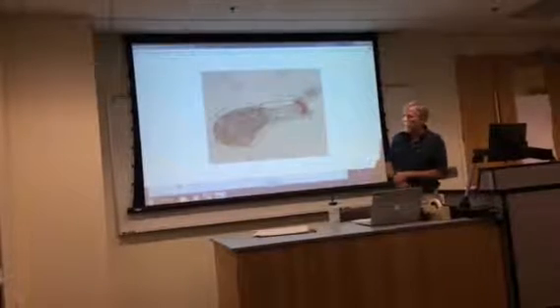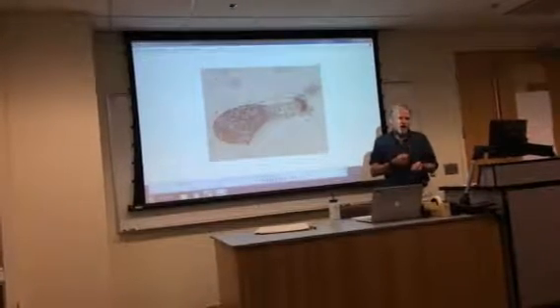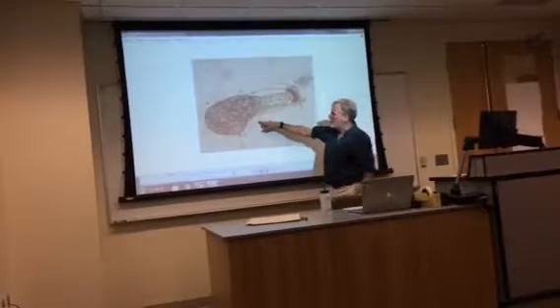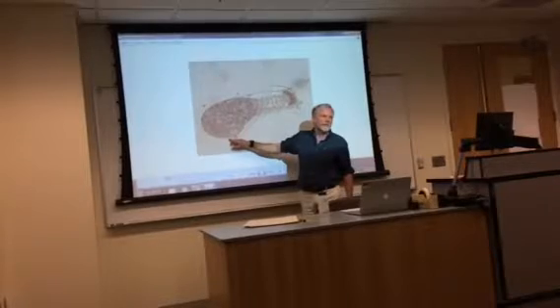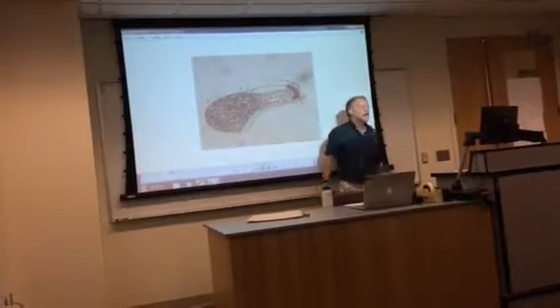This thing has gotten much bigger, and that sterile jacket of cells surrounding the egg, after the zygote forms, the sporophyte forms, it gets stretched and stretched and stretched, and ultimately ruptures. Right? And then outside of that is what we call a perianth. Those are other leaves that surround that.